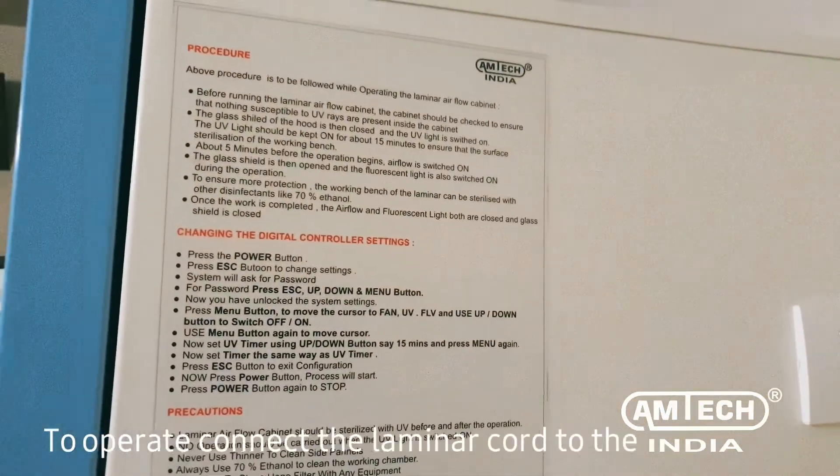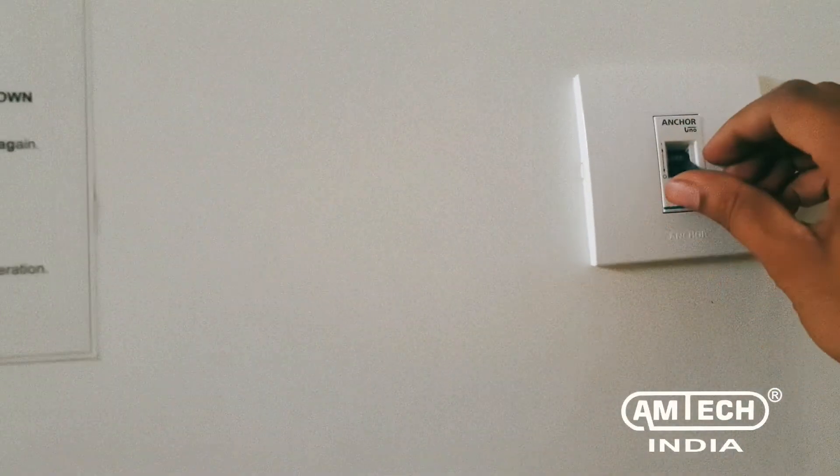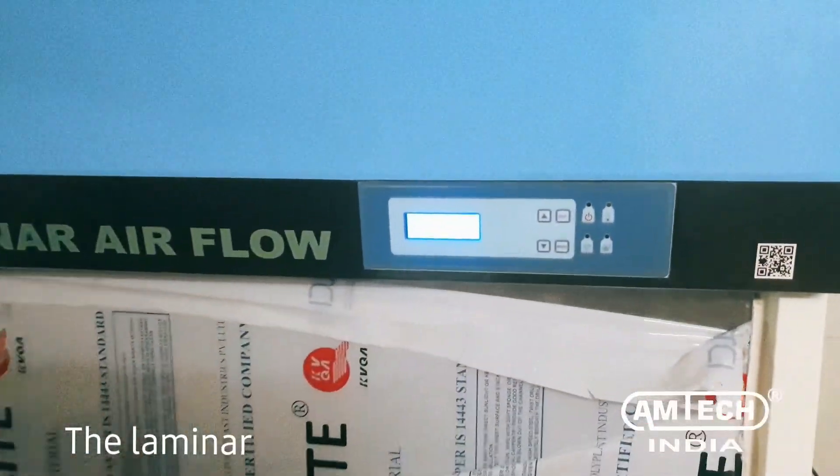To operate, connect the laminar cord to the power socket and turn on the MCB. The laminar will now turn on.